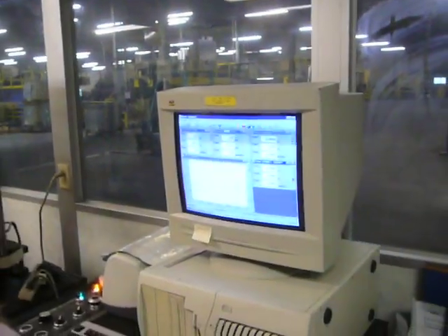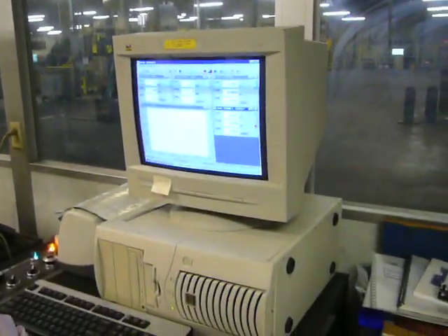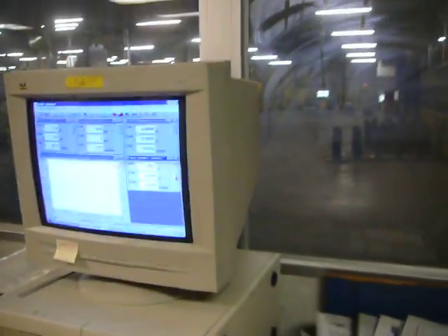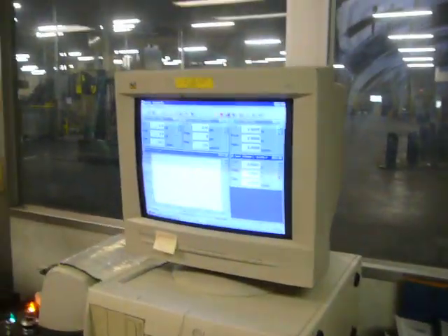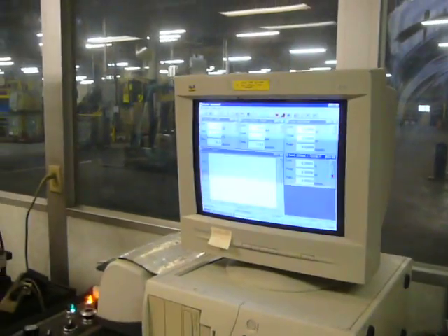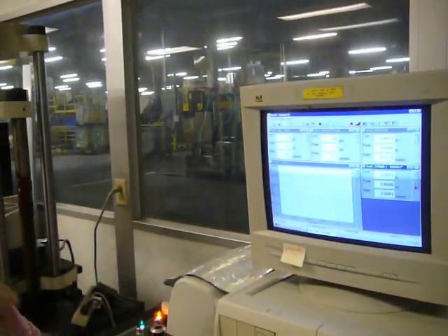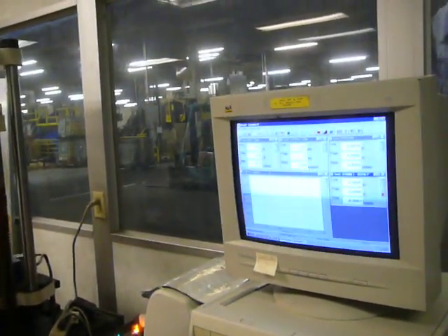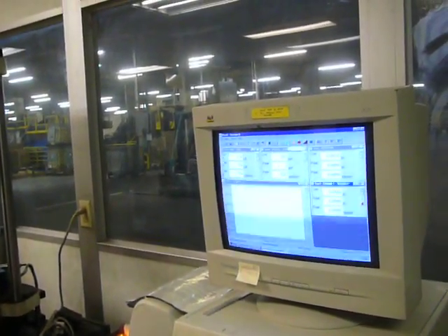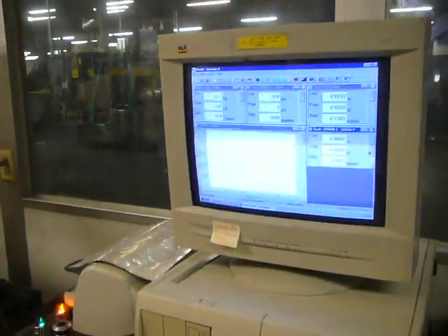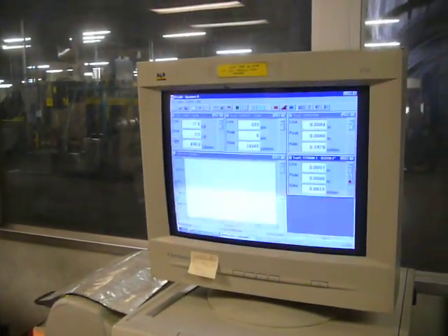Here's Brenda. She used to run this machine here. I'm going to drill it and start the pump up. Go ahead and speak as you're doing it, Brenda. I'm going to drill it, start the pump up, and then push the start button. That'll start to stretch.